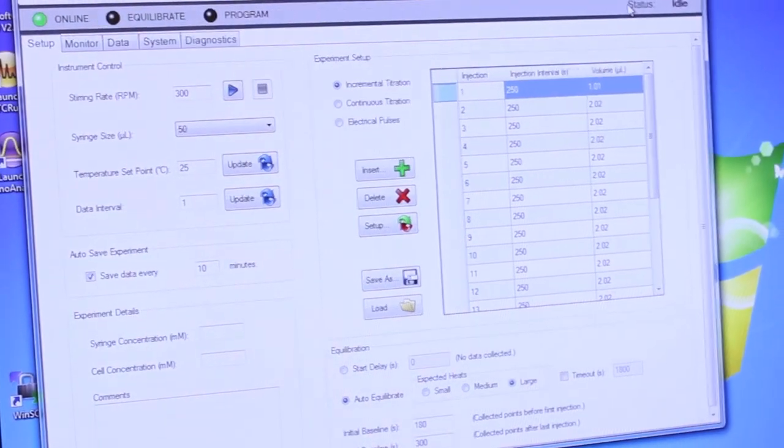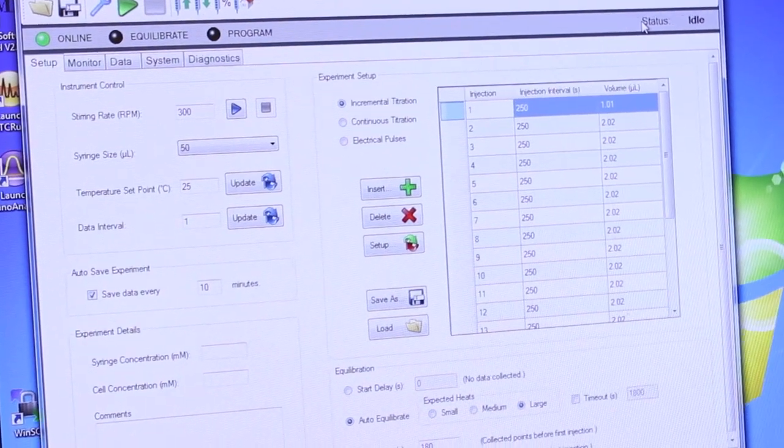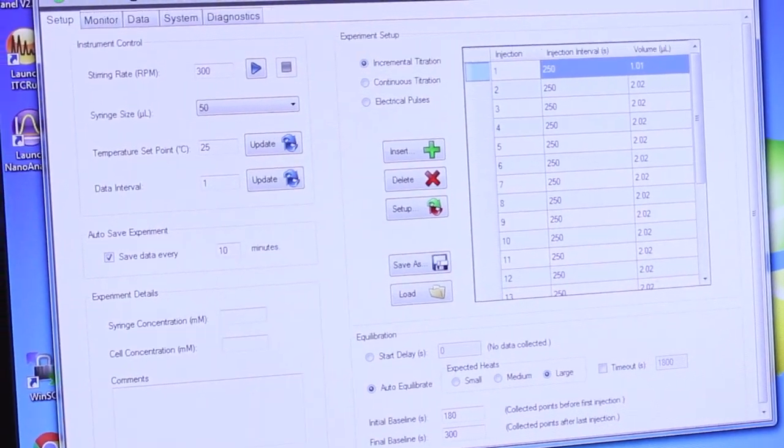When the home reset is finished, it will say that the status is idle and now the instrument is ready for you to start setting it up.